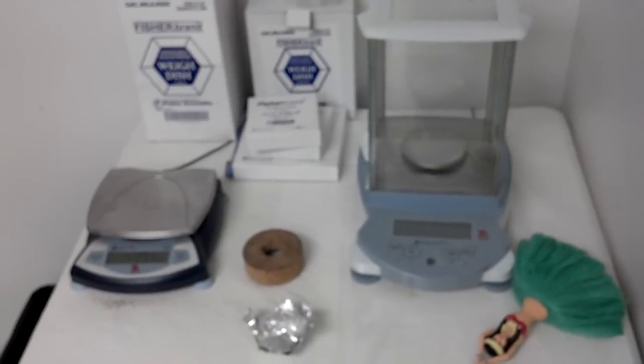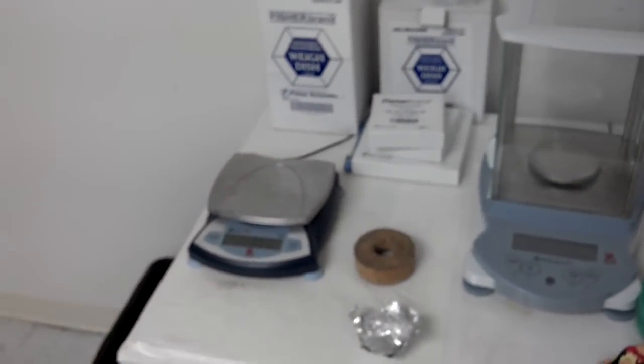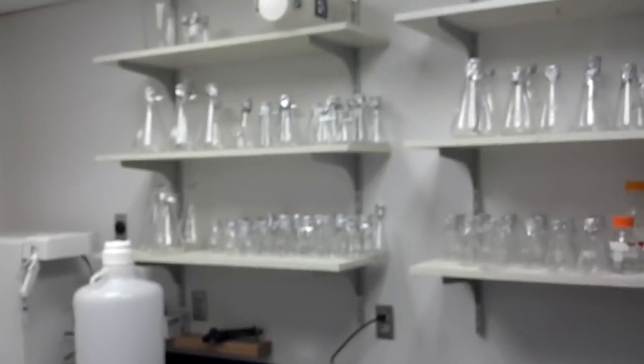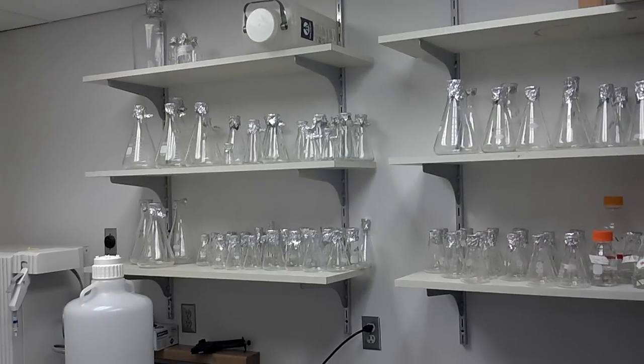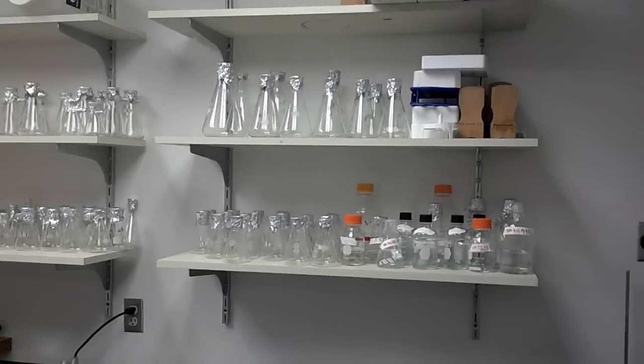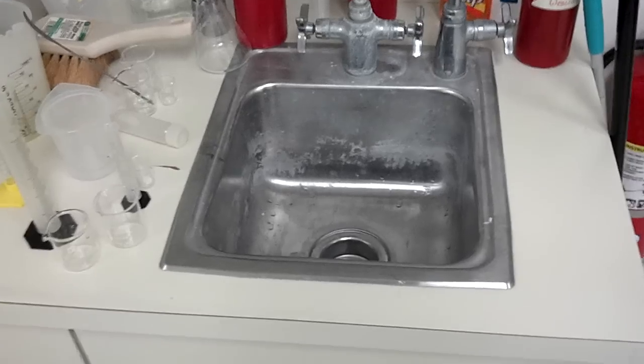Some balances where we weigh things out, usually agar gels for running electrophoresis. More autoclaved bottles. Sink, where we dispose of probably a lot of toxic shit.